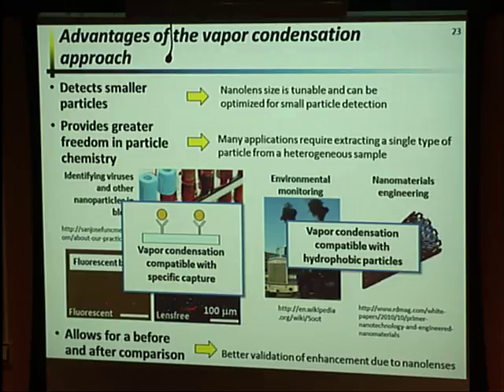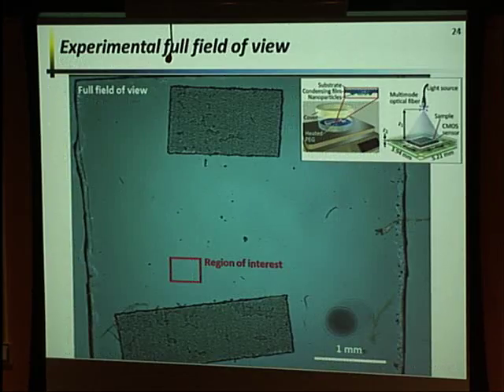The last advantage is that we're actually able to do a before and after comparison of exactly the same field of view, so that we can get a very quantitative assessment of the enhancement due to these nanolenses. So this is a typical experimental result.